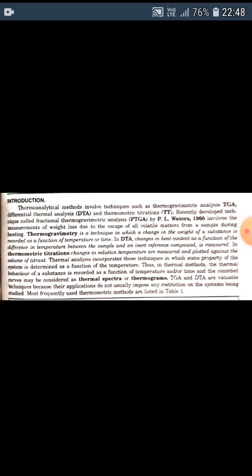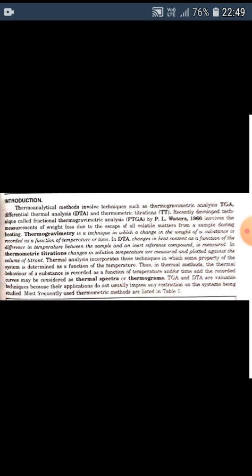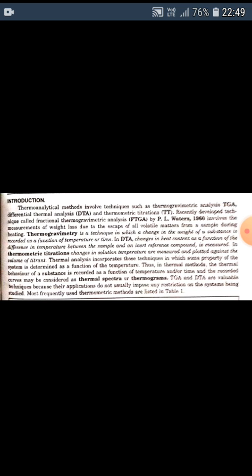Thermogravimetry is a technique in which a change in the weight of a substance is recorded as a function of temperature or time. In differential thermal analysis, changes in heat content as a function of the difference in temperature between the sample and an inert reference compound is measured. In thermometric titrations, changes in solution temperature are measured and plotted against the volume of titrant.